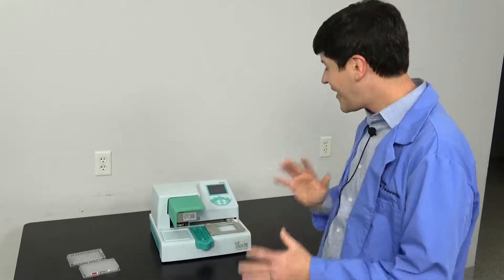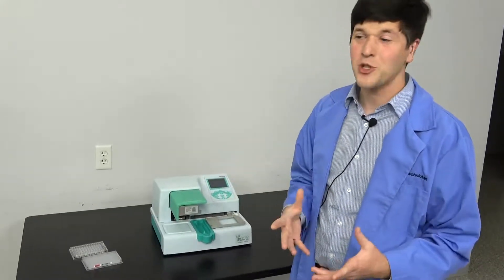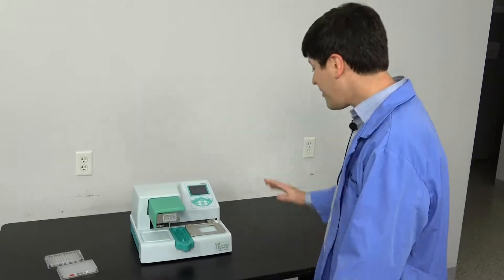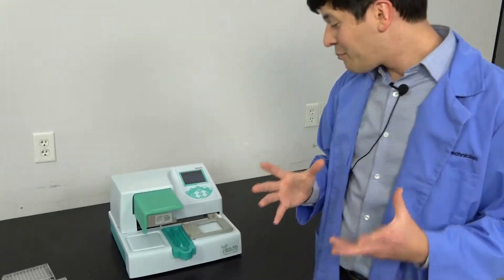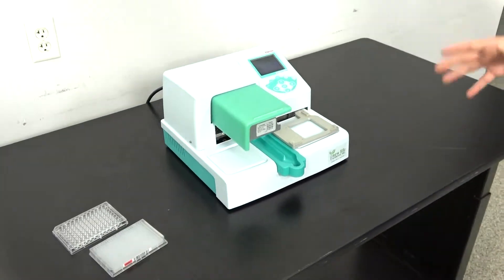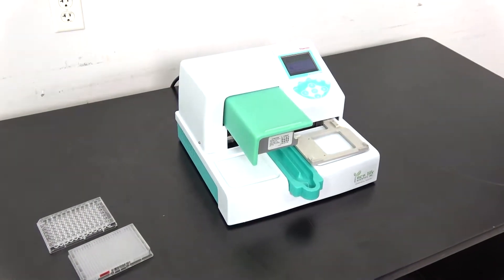You can select which columns you want, which rows you want. It's got a colored display for selecting your options. It's really easy to use — it really took me no time to explore it. There are a lot of people that run after these things and they're a big time saver if you need to fill plates like mad.